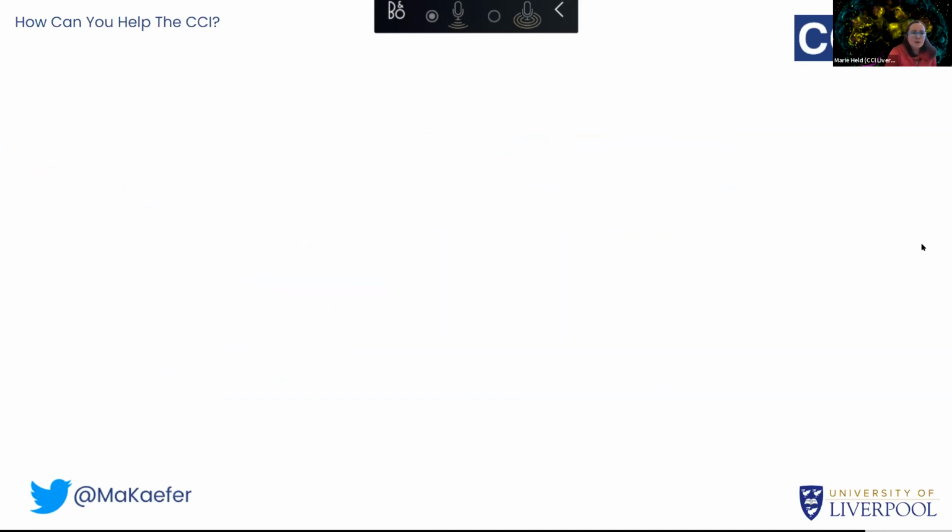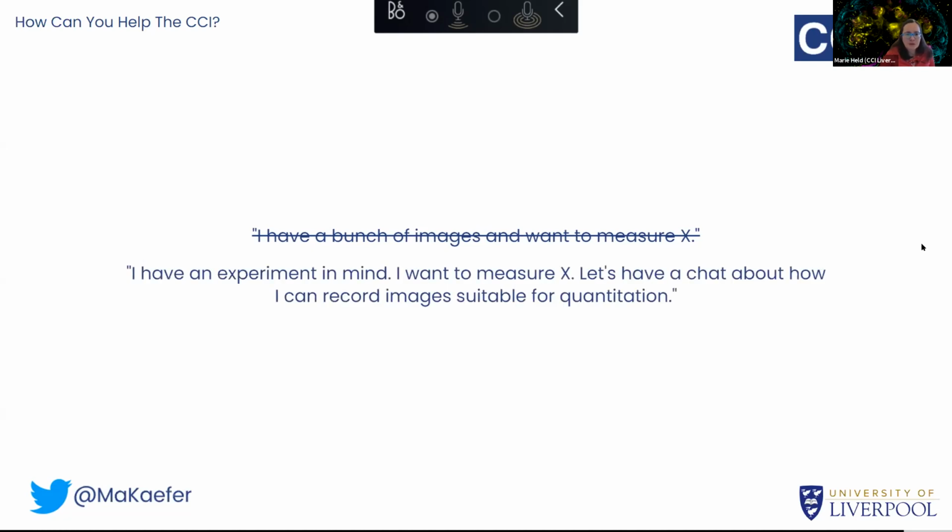So one question is now, how can you help the CCI? So rather than coming to us to say, I have a bunch of images and I want to measure something, I appreciate it's not always possible. We'd prefer if you came to us and said, I have an experiment in mind, I want to measure X. Let's have a chat about how I can record images suitable for quantitation. So there we're back to the image analysis might actually guide your experiment and your microscope settings, or your image recording settings to make it suitable for analysis.